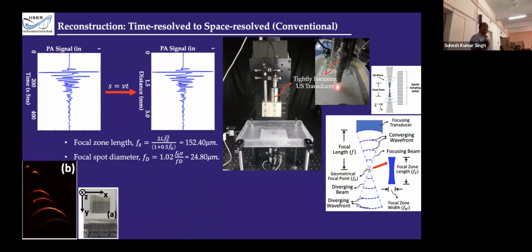This is the theory about it, and this is the reconstruction by using this one. We cannot do the imaging of the target beyond this; only this region is reconstructed well, others are not reconstructed. So we are not able to get it, and the application is very limited for biological application. The sample size should be limited to this 150 micrometers. So it is very limited.